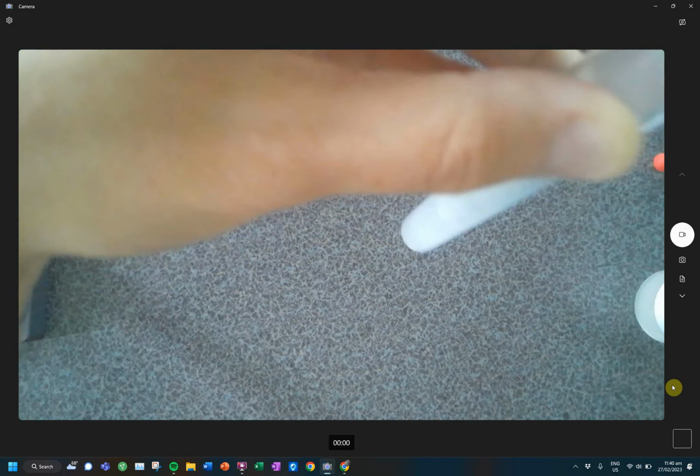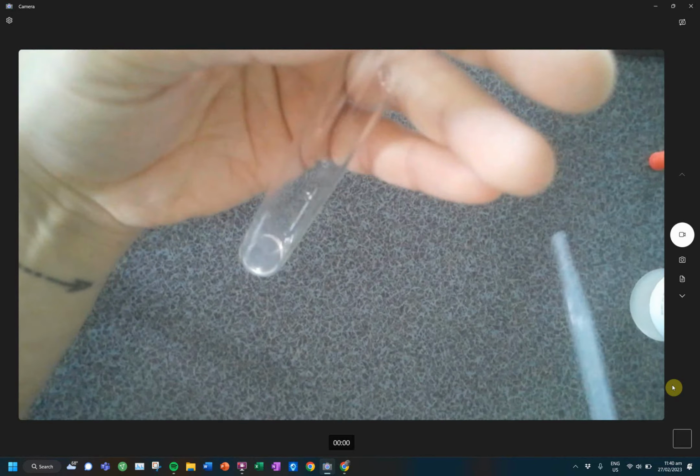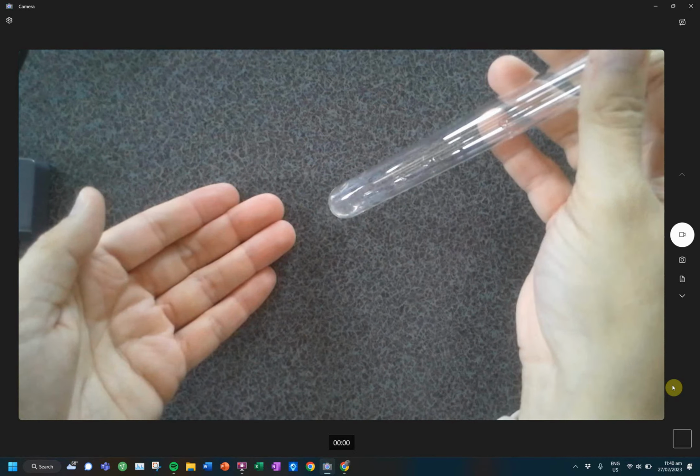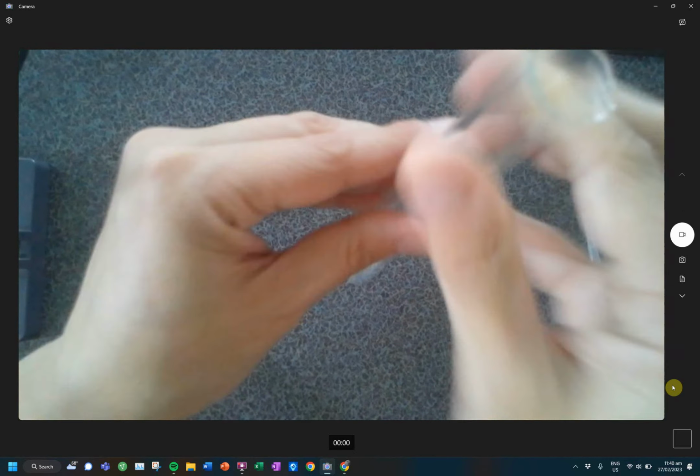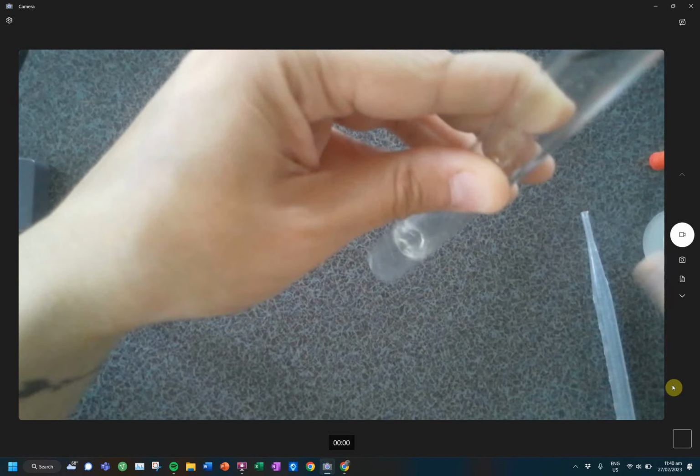The other thing I can do is take some of it and add it to a new test tube, so that my ratios are a little bit better. It's always worth double and triple checking things. So I can see here that that's still a cloudy solution. I want to make sure it's going to go away.